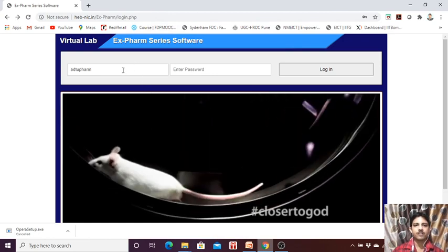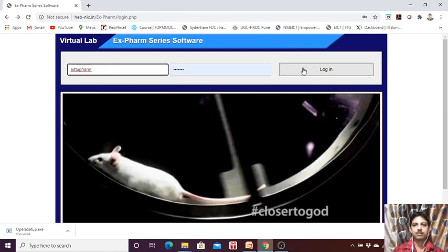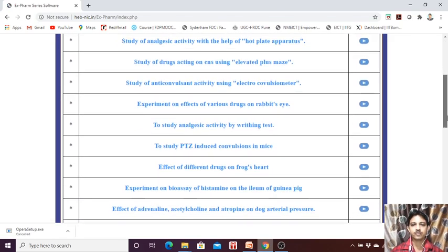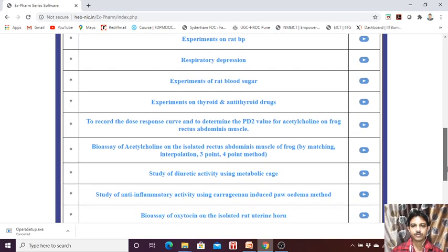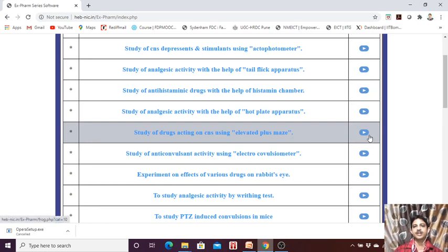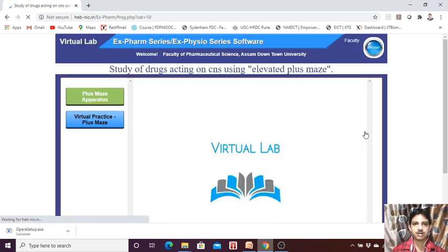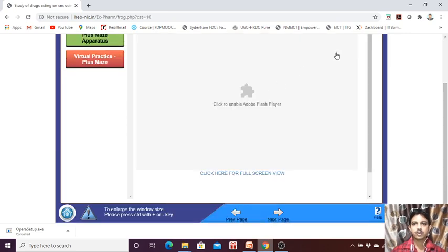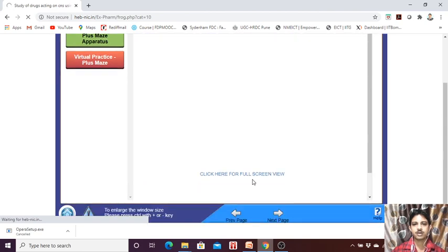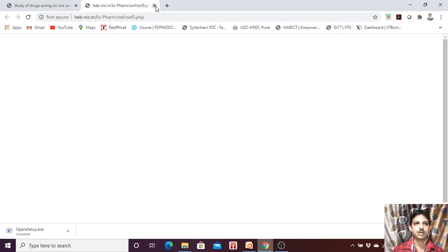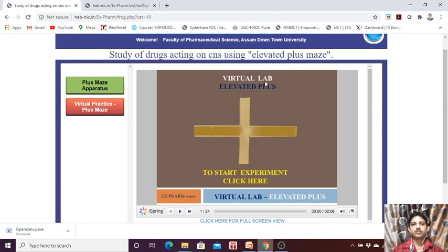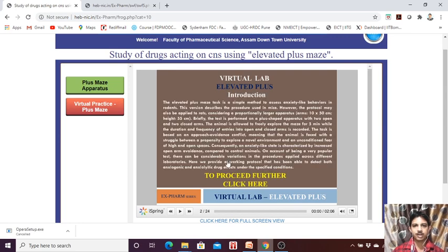We will start with the virtual lab. Put in the required credentials and enter into the software. After entering, you need to find where the experiment is — the elevated plus maze experiment. The use of the drug is in elevated plasma. Enter to the next page, enable Adobe Flash Player, and click Start.